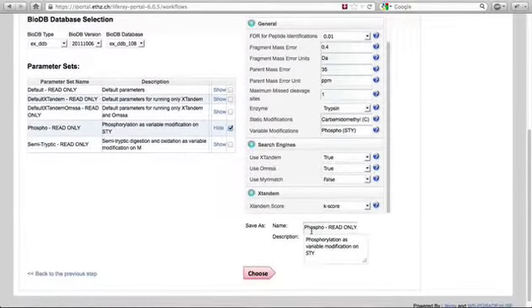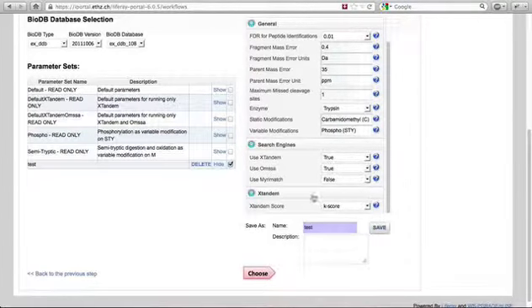There's also a way of simple storing own-made parameter sets so that one can reuse them in another step or even distribute among different users.